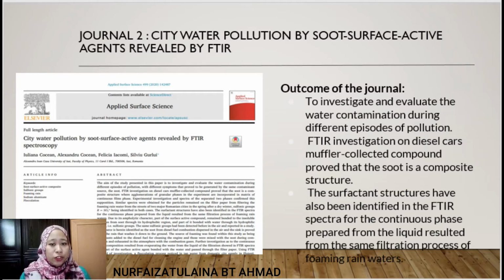FTIR investigation of compounds collected from diesel cars' mufflers proved that the soot is a composite structure where agglomerations of granular phases are incorporated in a matrix of continuous film phase.